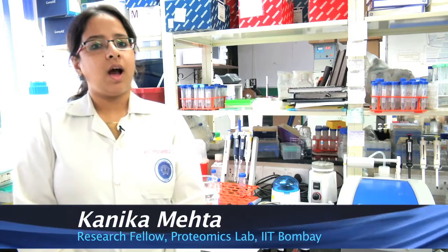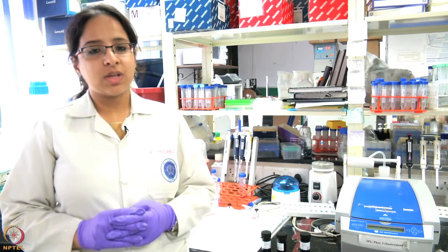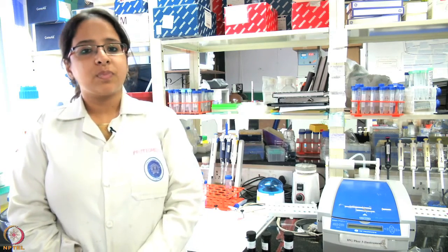When we run a 2D gel, we normally run 2 to 3 gels. One represents a control gel, another is a disease gel or differently treated sample, and then we compare the different gels, which sometimes leads to reproducibility issues because the same spot will not be present at the exact location in the 2-3 different gels. So, we have an advanced technique, DIGE, which overcomes these gel-to-gel reproducibility issues, as we have to run only one gel for 2-3 different samples.